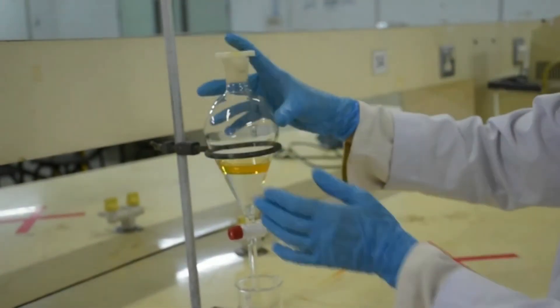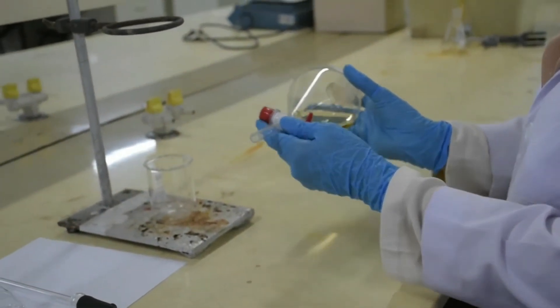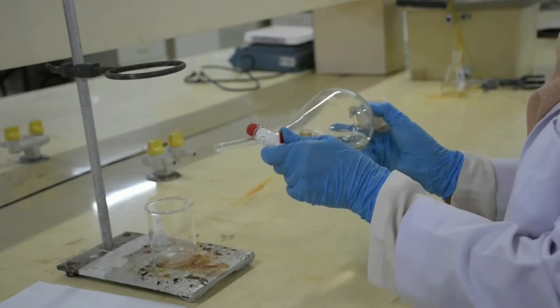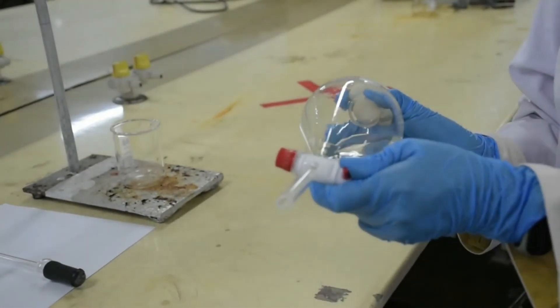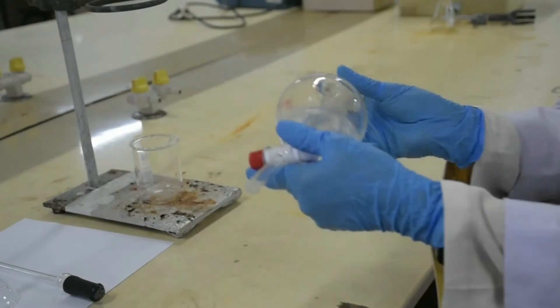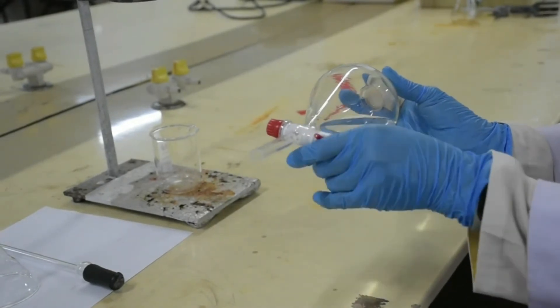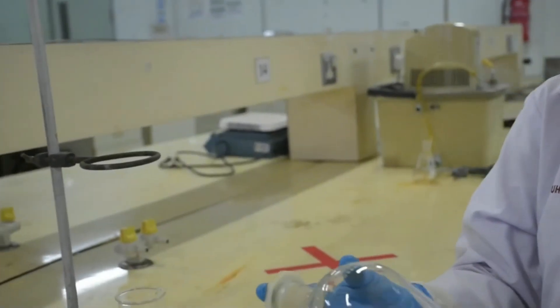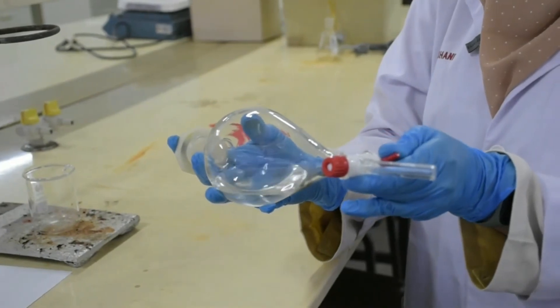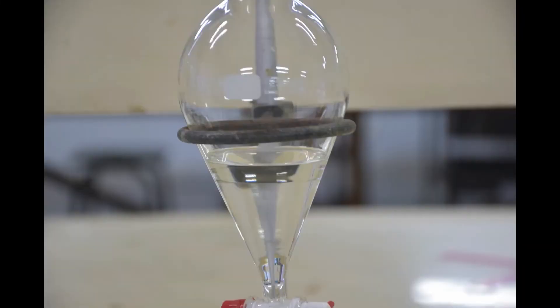Close the separatory funnel and swirl it. Observe the formation of two layers.